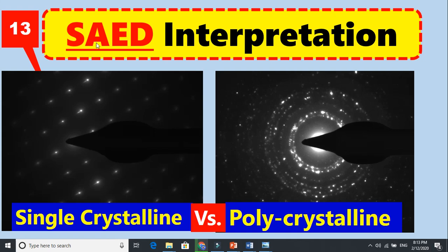Selected area electron diffraction and how to interpret this. This image is for a single crystal — it is just dots, and these dots are located at exactly the same position from each other. This means there is complete order. The right side image is for polycrystalline material. How these rings are formed and why there is no ring in single crystal — watch this video and it will be made very clear.